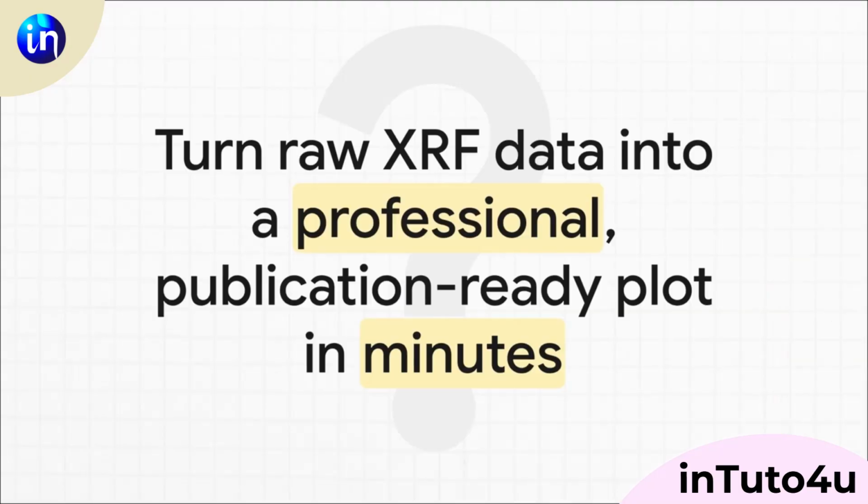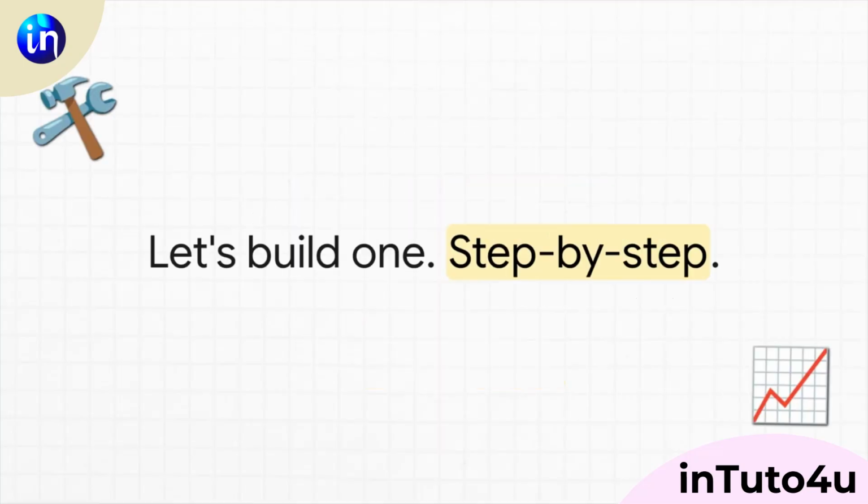So can you really turn that raw data into a polished, journal-quality graph in just a few minutes? It might sound like a bit of a stretch, but believe me, the answer is a big yes. You absolutely can. In this explainer, we're going to walk through exactly how to do it. We're not just going to talk about it, we're actually going to build one right here together, step by step. By the time we're finished, you'll have a super clear, repeatable process to make your own research look sharp and totally ready to share with the world.